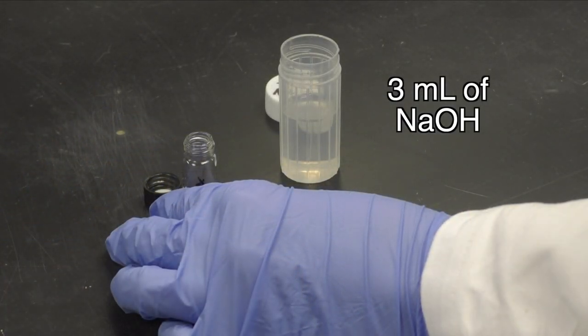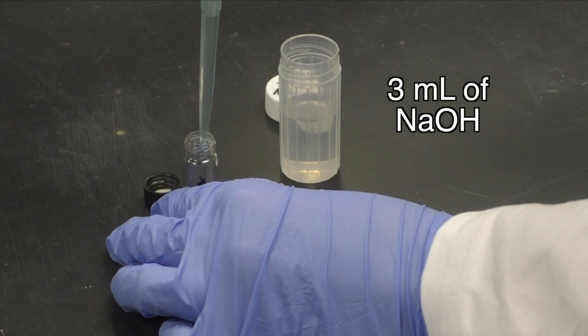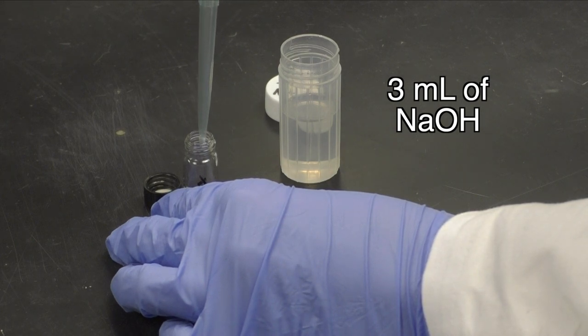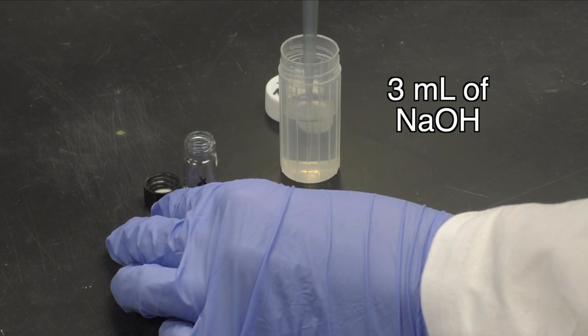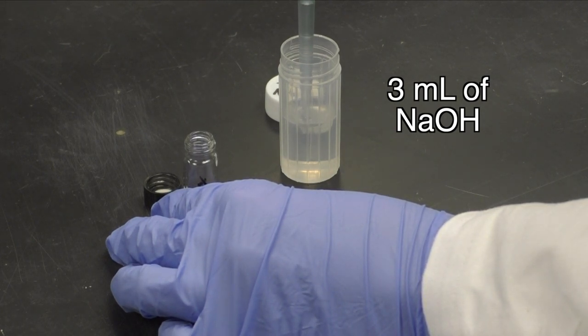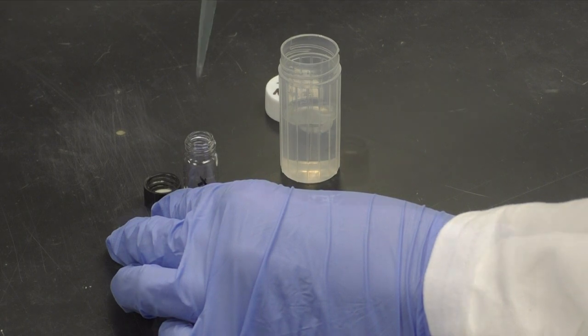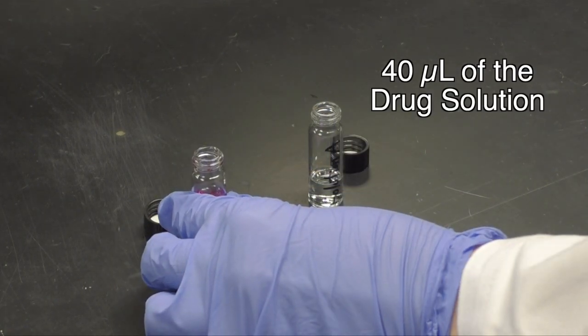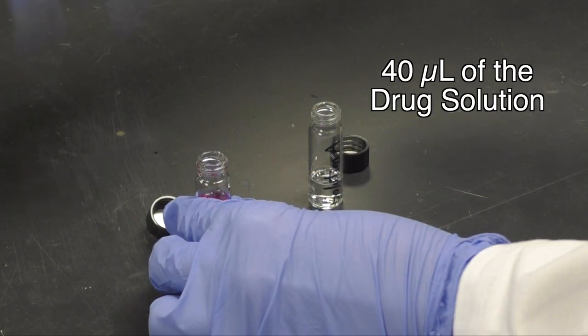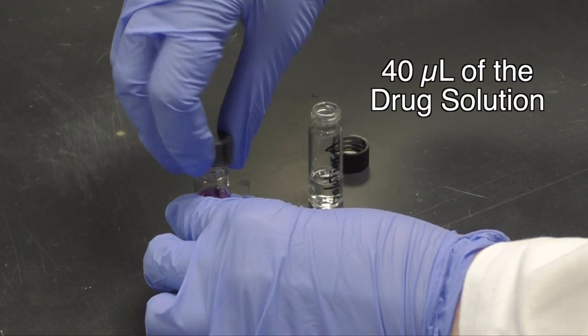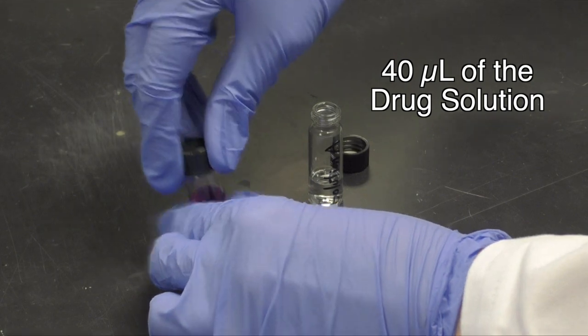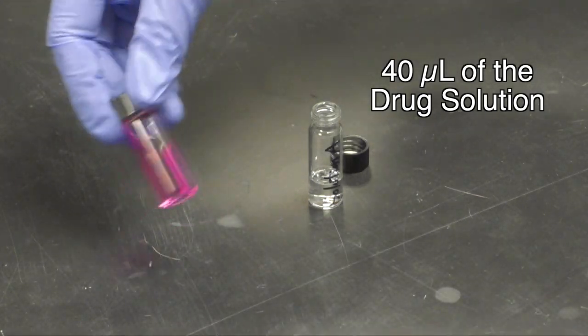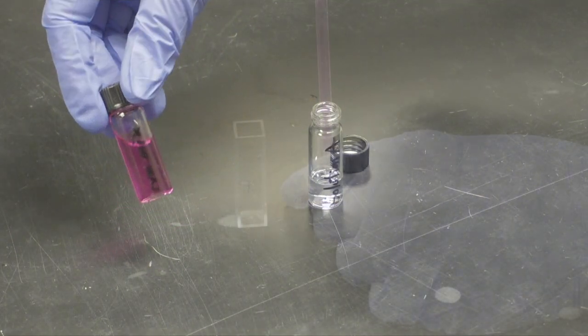To begin your reaction, transfer 3 mL of sodium hydroxide to a clean 1-dram vial. Then transfer the desired drug solution to the same vial, cap it, and shake it.